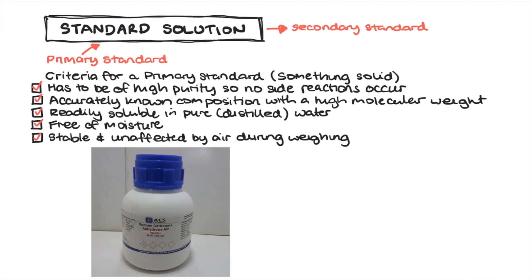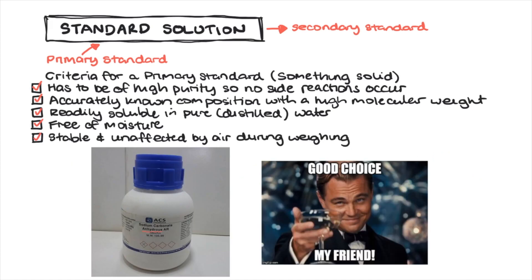Anhydrous sodium carbonate, however, is a suitable primary standard. The white solid is dried in a drying oven and then allowed to cool in the desiccator. The final product is free of water and its exact composition is sodium carbonate.